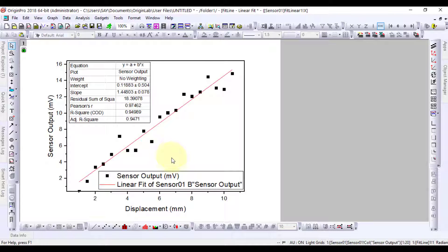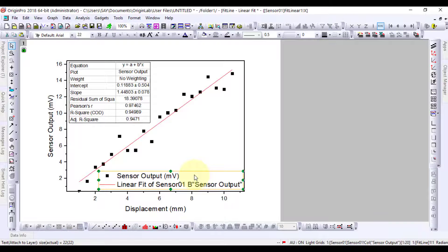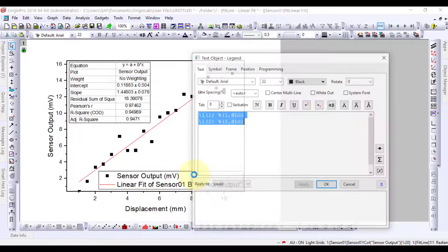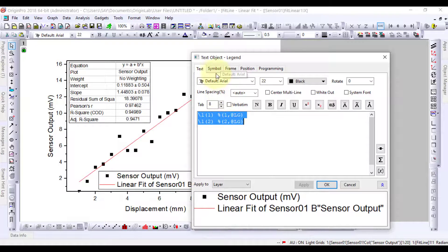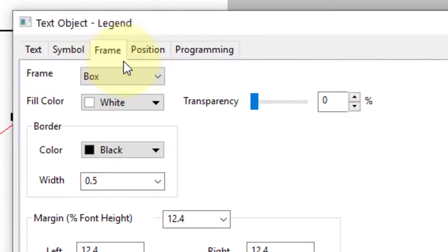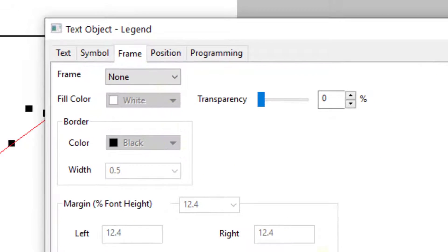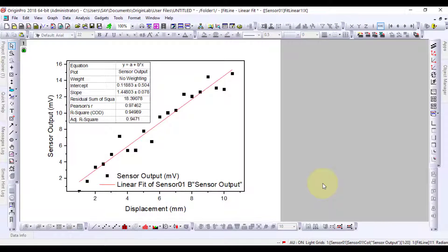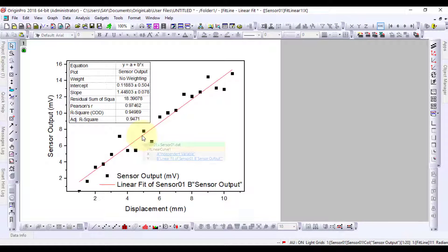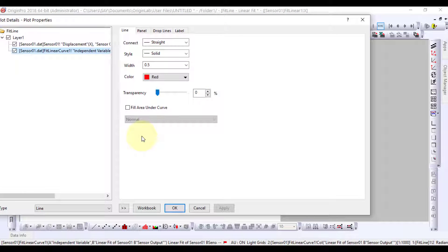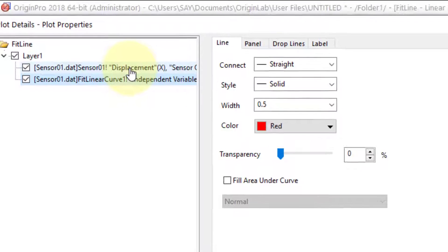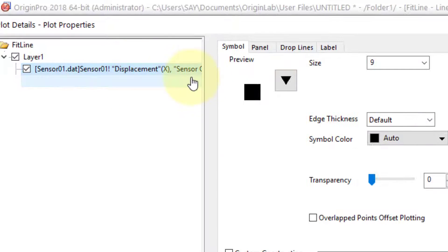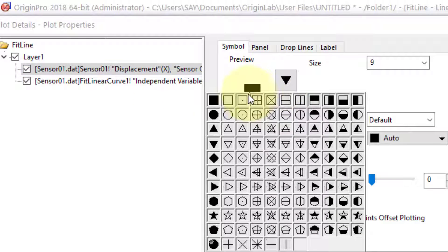We can do some modifications to the legend by double clicking it. Now, let's make some changes to the plot to have a good look. Keep in mind, most of these changes are optional and are only to portray a good look of the plot.